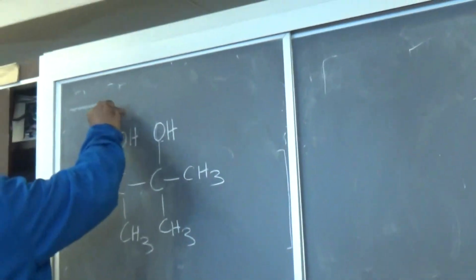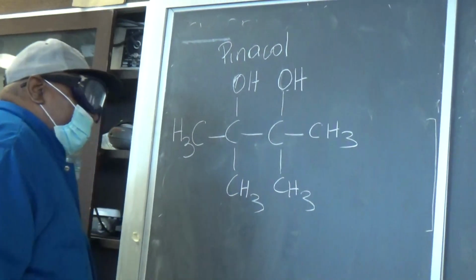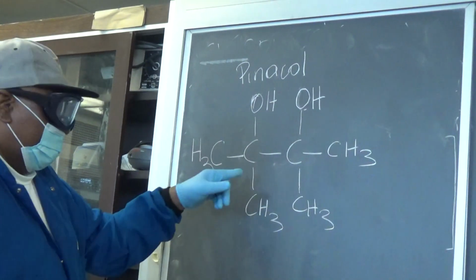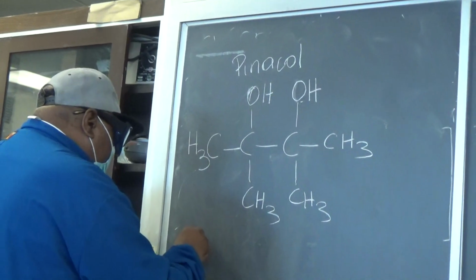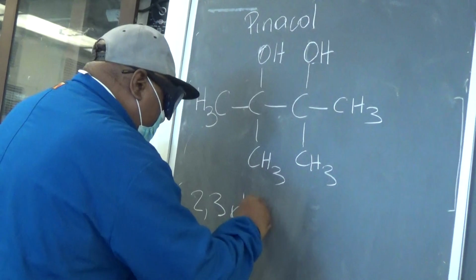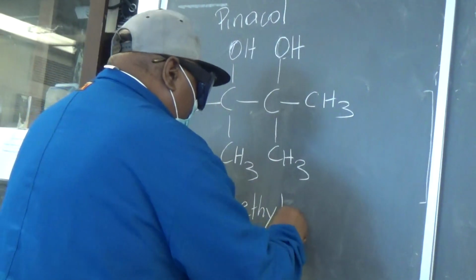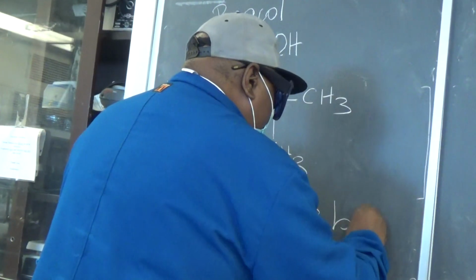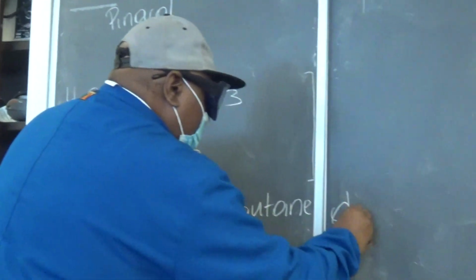We call that pinacol. But if you are taking Dr. Anderson's class, you have to know the name according to IUPAC, which is 2,3-dimethylbutanediol.